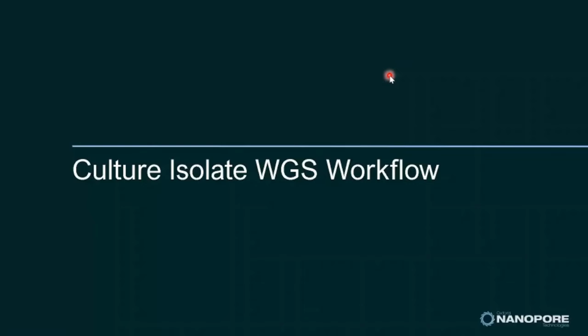Next, we will go into a slightly more in-depth workflow of how we use nanopore technology for sequencing a bacterial isolate, or for quasi-metagenomic purposes, the non-selective, non-specific or metagenomic methods. The first one will be culturing the isolate using the whole genome sequencing workflow.